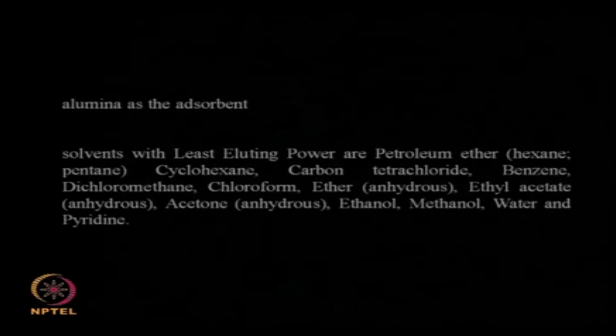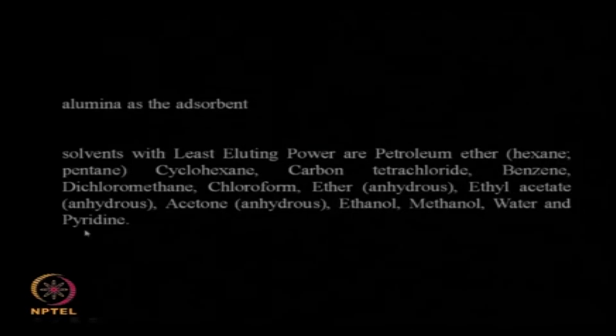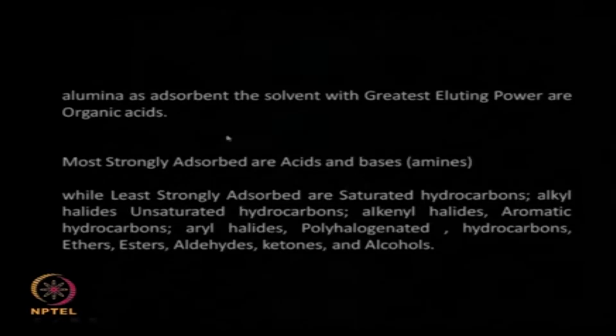So if alumina is the adsorbent, solvents with the least eluting power are petroleum ether, that is hexane, pentane, cyclohexane, carbon tetrachloride, benzene, dichloromethane, chloroform, ether, ethyl acetate, acetone, ethanol, methanol, water, and pyridine. So that is how it goes, solvents with the least eluting power. If you use alumina as adsorbent, solvents with the greatest eluting power are organic acids.